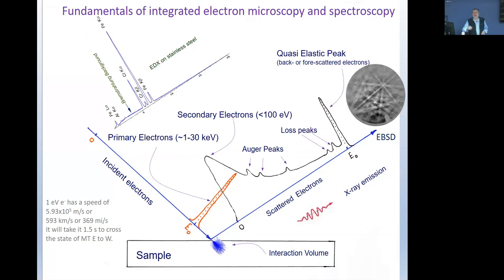Recep, what about your sputter rate, and what is the practical depth for profiling in depth that you can do? Excellent question. Dave is asking the sputtering rate. It depends on the energy. We have sputtering rates going from half a nanometer or 1 nanometer per minute up to maybe 20 nanometers per minute. We don't go very deep because when you start sputtering the material, you're actually changing the chemistry and stoichiometry. So watch out for depth profiling.